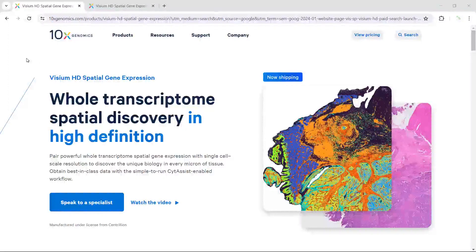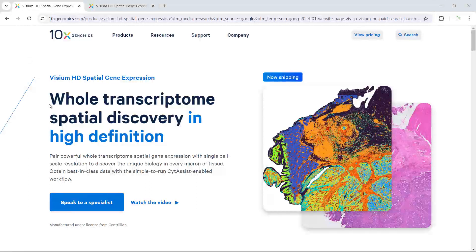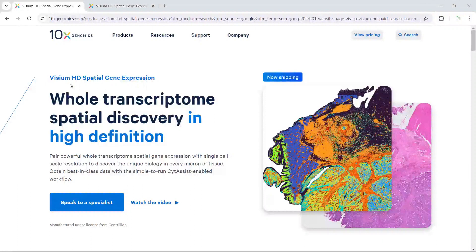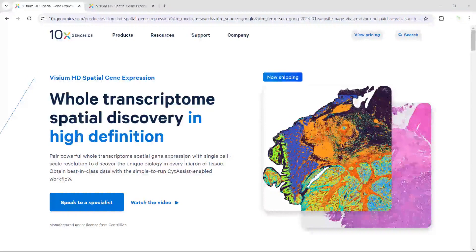Hello everyone. Welcome back to my video tutorial for spatial sequencing dataset analysis. Today I'm going to show you how to analyze the VZM high-definition spatial gene expression data. The VZM HD spatial gene expression data are the latest technology from 10x Genomics. This new technology can generate whole transcriptome spatial gene expression data with single cell scale resolution.